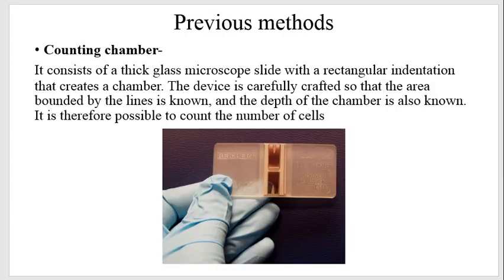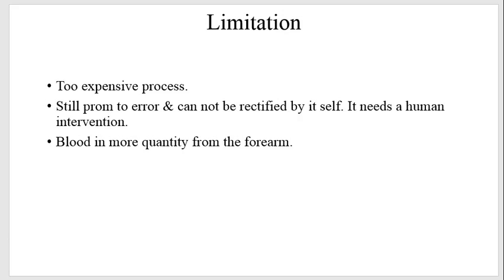If that 1 nanoliter has 270 cells, then what is the amount of cells in 1 microliter? It is back calculated, and the calculation is done multiple times to avoid error. Each Neubauer chamber has two symmetrical chambers, so that the count can be doubled or counted 2 times. Further, it has 16 sub blocks and then 25 sub blocks, out of which we choose 5 diagonal blocks.